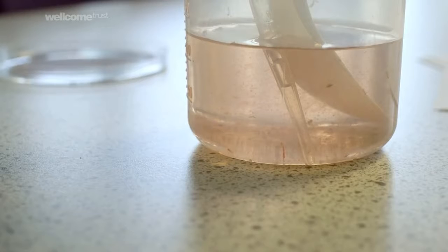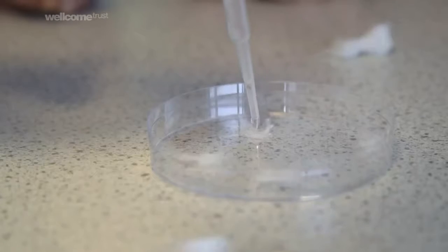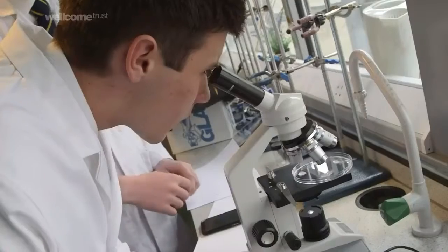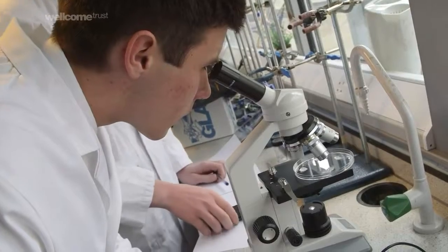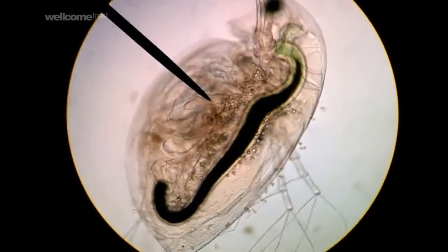The experiment that we're doing today is looking at one example of a zooplankton-like organism, Daphnia, but it's looking at the effect of temperature change on that organism's metabolic rate. When we subject this Daphnia to different conditions, water of different temperatures, we can actually see the heart rate changing, so speeding up or slowing down depending on the temperature of the water.